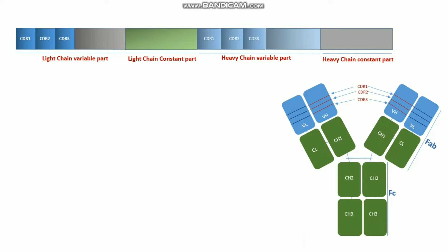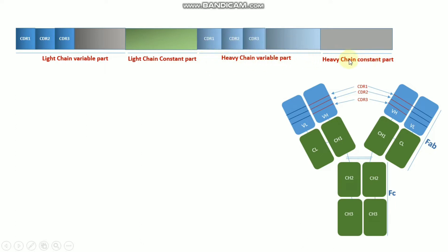Here you can see the antibody sequence map showing CDR1, CDR2, and CDR3. The light chain variable part contains CDR1, CDR2, and CDR3, followed by the light chain constant part. Then the heavy chain variable part also contains CDR1, CDR2, and CDR3, followed by the heavy chain constant part.